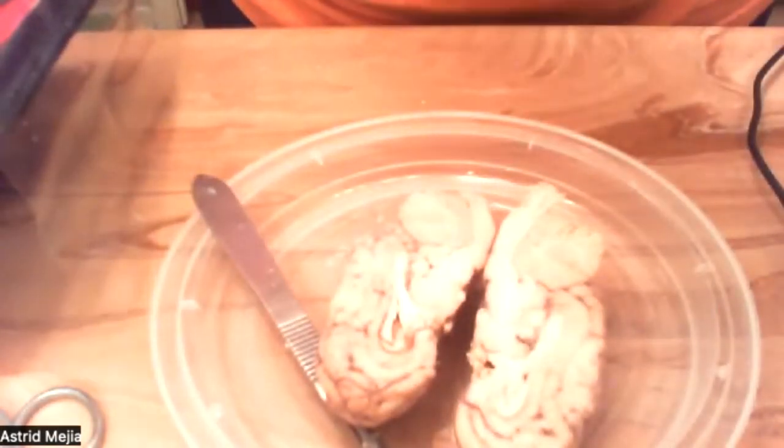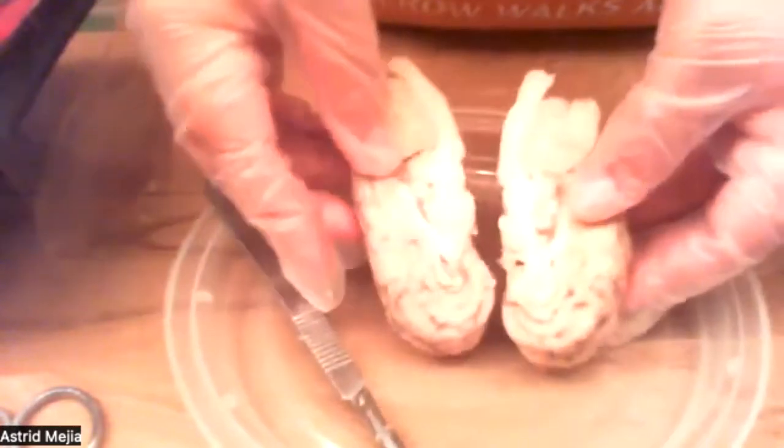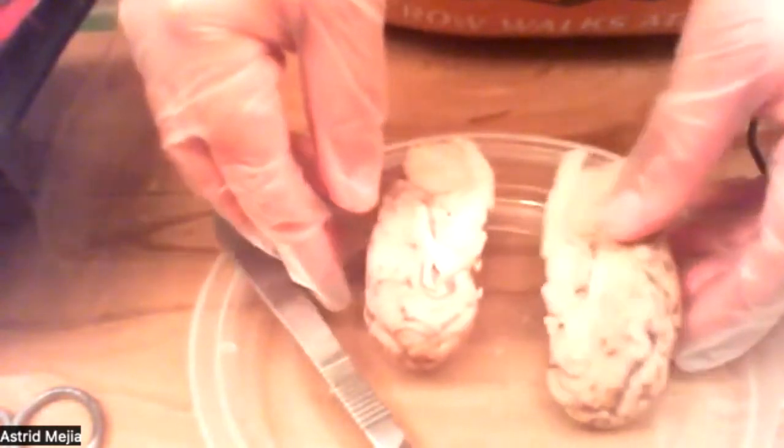So it would look like this. It would look like this. Let's see. It focuses. And so it will look like this right here. Yeah. Trying to see if I can get a better angle at it. Okay, that looks better.